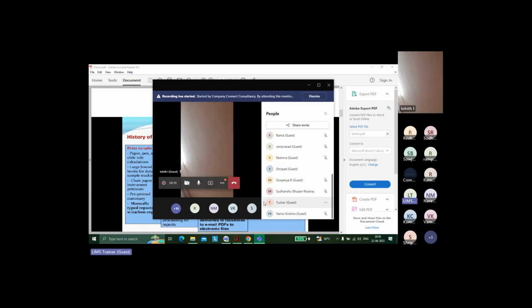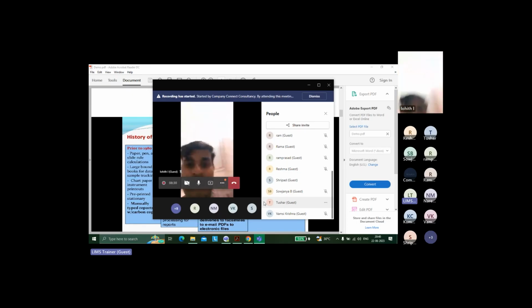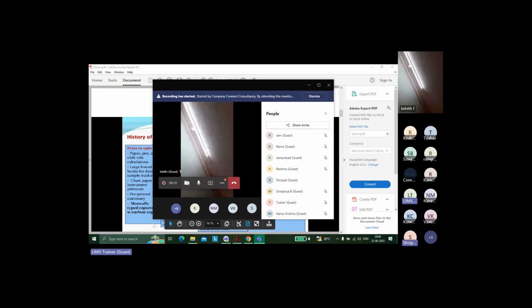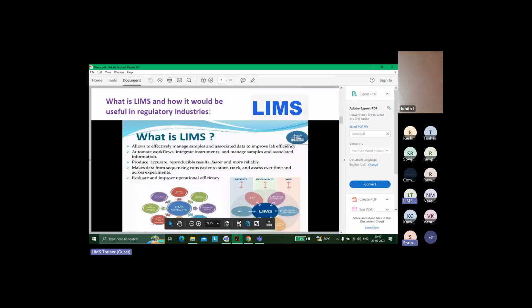And it's not only calculation. For example, there are two components, and if you enter values for two components and they are outside a particular value, then the stage 2 components jump in and you enter stage 2 values, and again stage 3. Those things are also possible in LIMS. You can configure it very beautifully. In very short, this is how slowly the need came for the laboratory information management system, and slowly it got modified and, down the line, became a better version with upgrades.